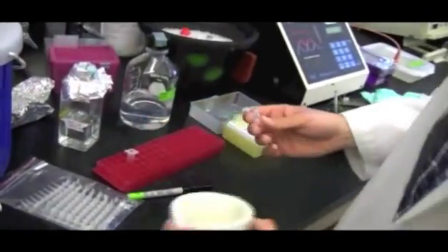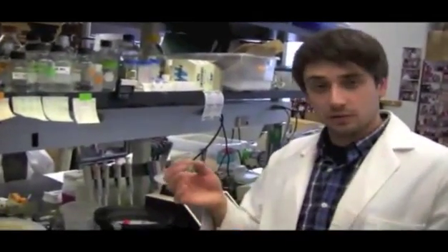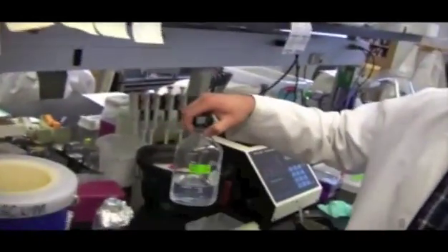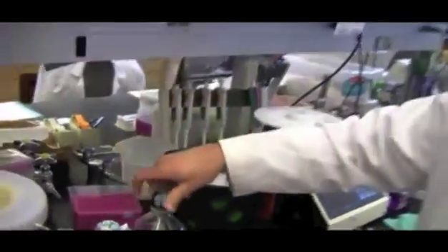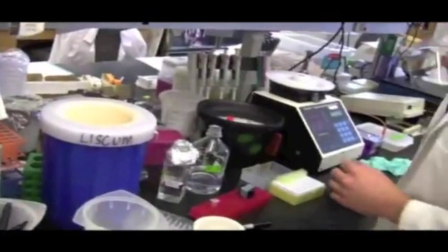Cool. Okay. Next we need to add some liquid that's going to help us separate everything else except for the nucleic acids, because again, that's where the DNA is and that's what we're interested in. So I'm going to add some of this stuff right here, CTAB buffer, and to do that I'm going to use my handy dandy pipette, if I can find it.